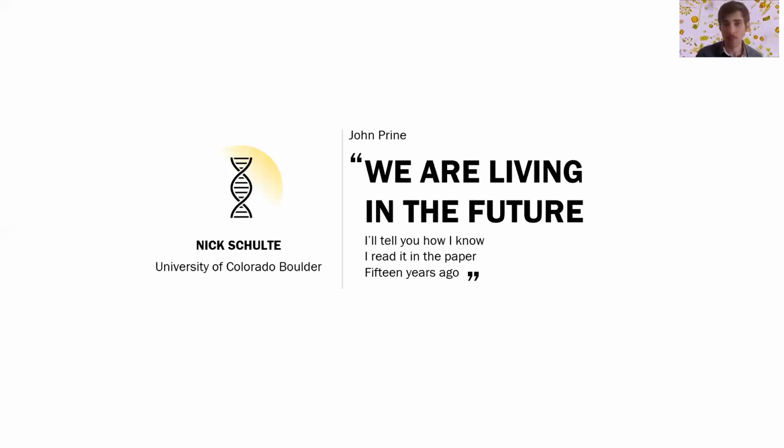I hope that work is out there, and I feel like there has been at least one study that looked at acid mine drainage diatom DNA, so that would be an interesting study to look into. But I'd say there's a high potential for that. Whether those mutations would show in the gene regions that we target for our current identifications is an open question, however. There might be mutations elsewhere in the genome, but they might not allow us to identify teratologically mutated taxa using our normal metabarcoding methods.